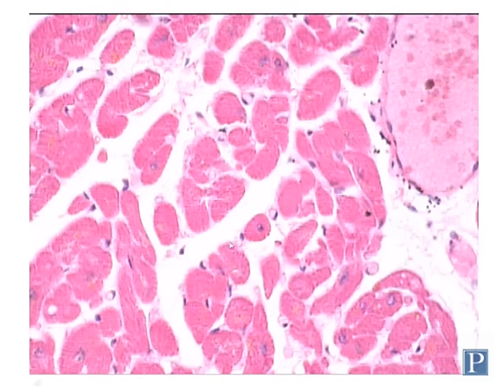You also need to be able to identify it in cross section. Now, students often tell me that cardiomyocytes and skeletal myofibers look very similar in cross section, and they do, but these are not nearly as large as skeletal muscle cells. Also, the nuclei of cardiac muscle cells can be in the center of the cell, so you often find them towards the center of the cell.